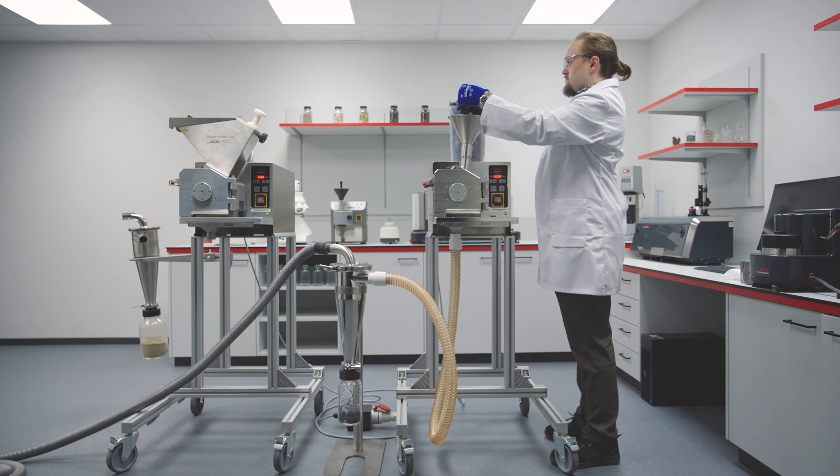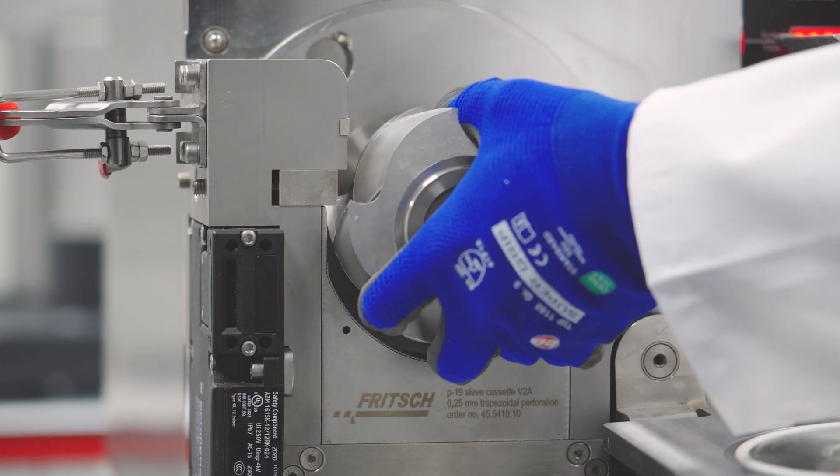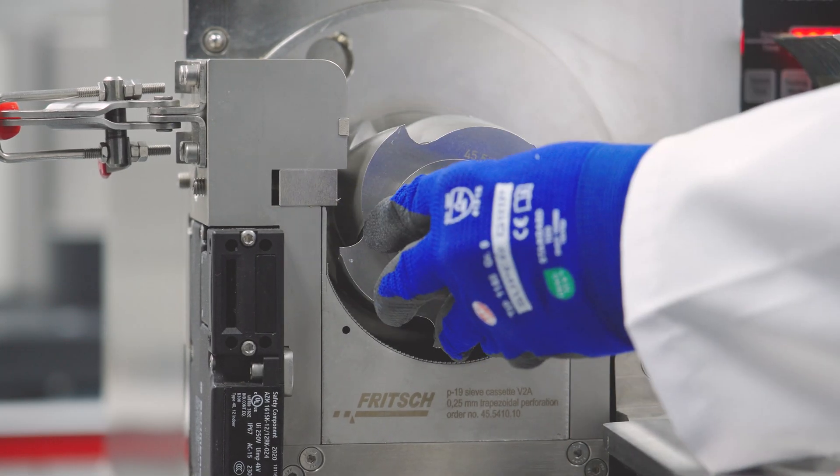A large-sized feed funnel, throughput of up to 85 liters per hour, and the tool-free clean design make operation efficient and cleaning simple.